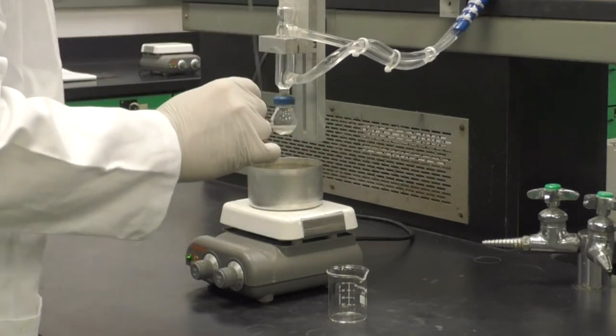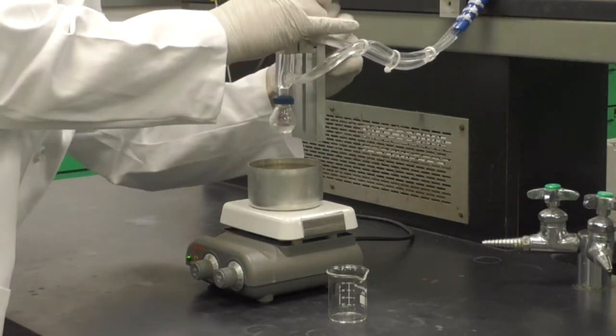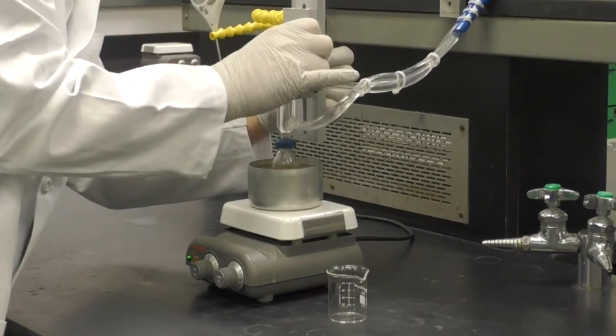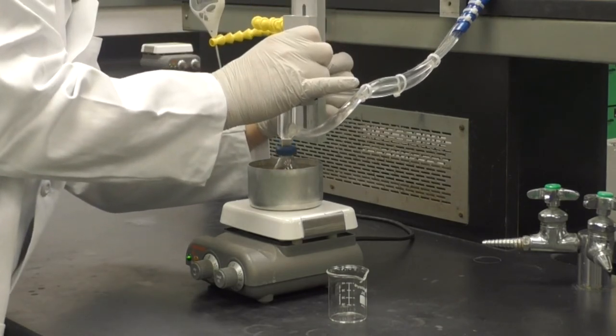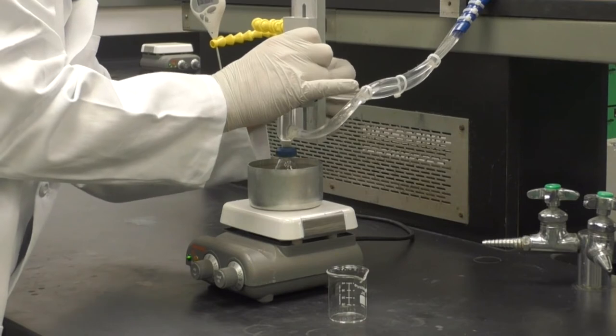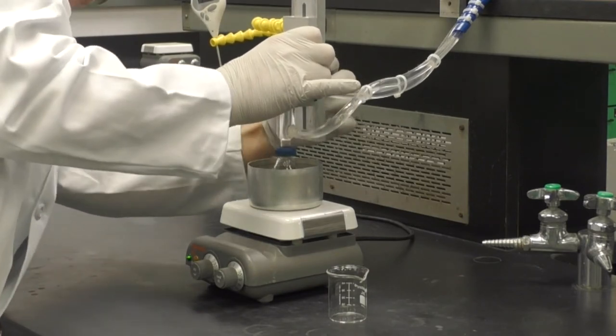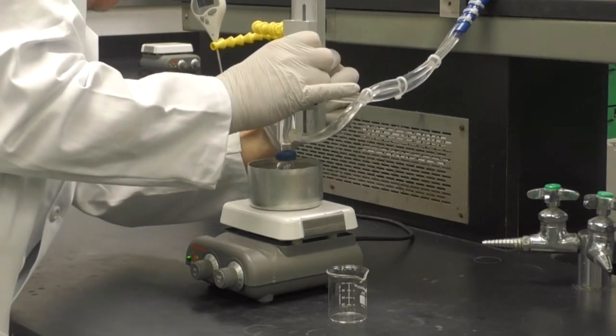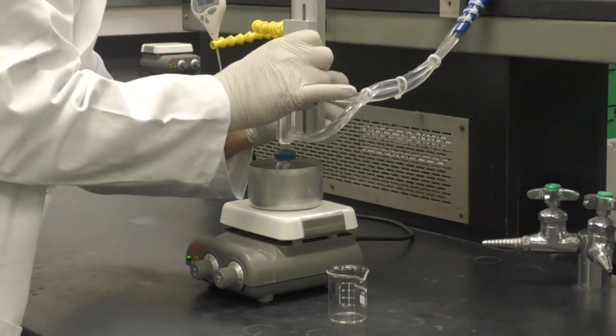Loosen the wing nut on the back side of the condenser's metal support so you can move the condenser up and down. Submerge about two thirds of the flask in the water bath. Tighten the wing nut so it is just snug. There is no need to over tighten.